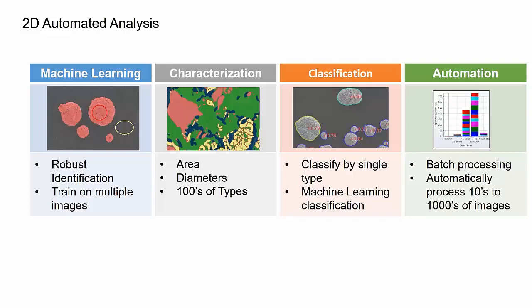In addition, importantly, there's a whole range of classification available to you, from a very straightforward size distribution analysis. I want to classify by a single parameter, a single measurement type, for example area, or in this case maybe roundness. For a particular SOP or workflow, I want to know the distribution analysis of my particles. It's very easy to set up, and you can repeat that over and over again as a standard operating procedure, for QA, reporting the distribution of my particles by size and setting up those bin ranges.